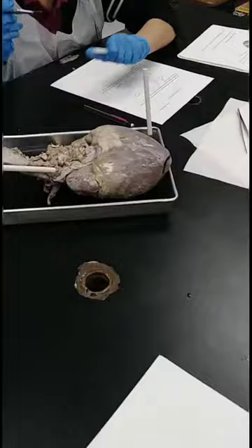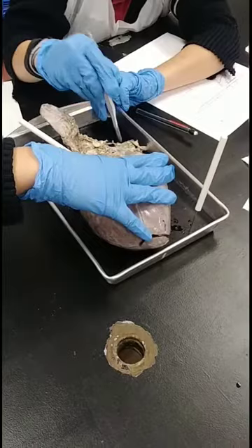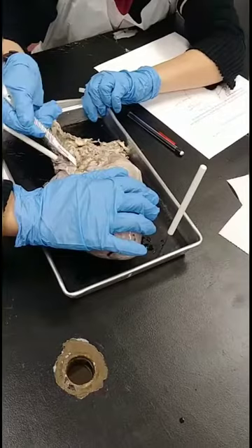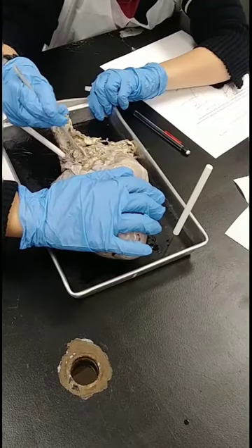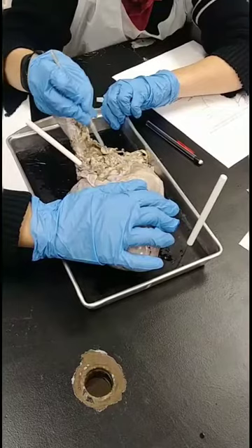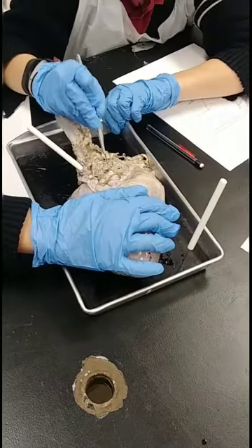Here's the front of the heart. It's not going to be at the bottom. Remember, the picture is showing the back of the heart. All right. So this whole big, thick thing is the aorta up here. Superior. Here's the aorta. Your scalpel will go as low as that to help with the other stuff. Okay. This is going right into an atrium. So that's right here. So there's one of your probes. Okay, let's mark that.